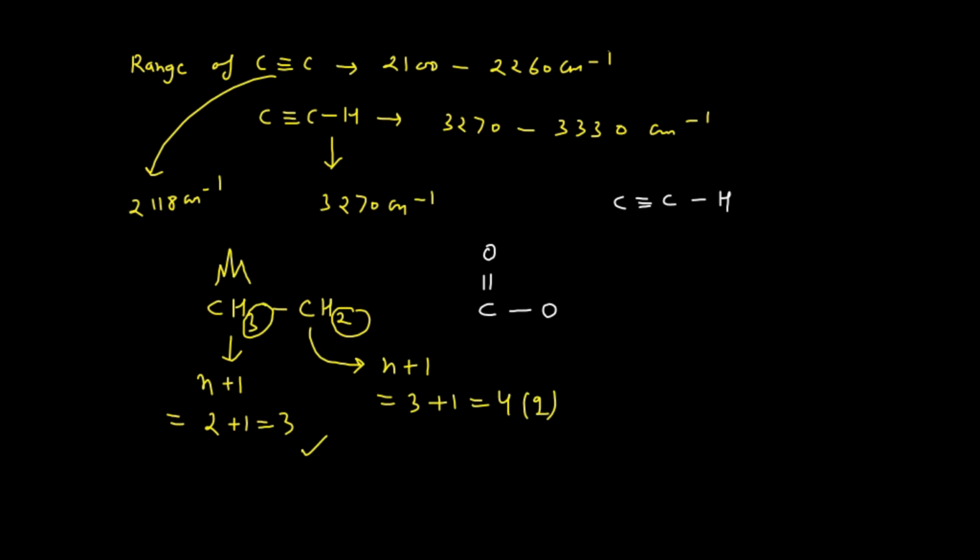And this is a triplet, and this will produce a singlet here. You know this singlet resonates in the NMR spectroscopy somewhere at 2.0 to 3.0 ppm. This is the range of the chemical shift in the proton NMR spectrum.